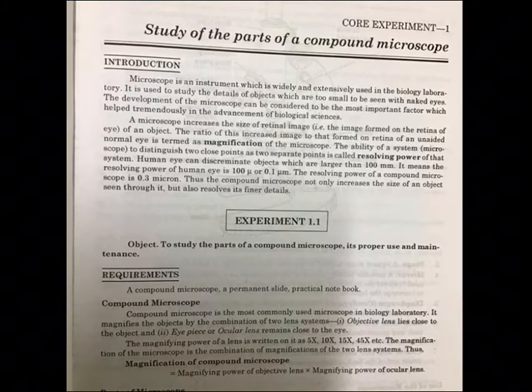Thus, the compound microscope not only increases the size of an object seen through it, but also resolves its finer details. So this is the background of the compound microscope. Basically, compound microscopes help us in making things bigger, particularly when we are seeing unicellular organisms like amoeba, paramecium, bacteria. We are able to make them bigger.